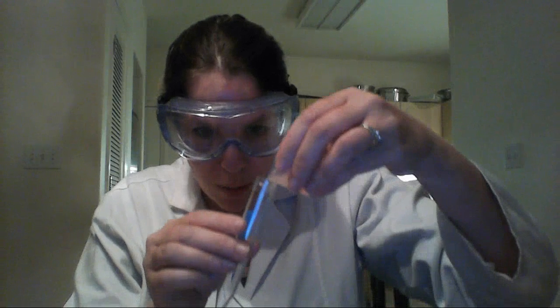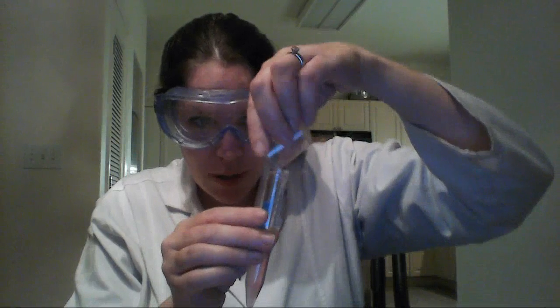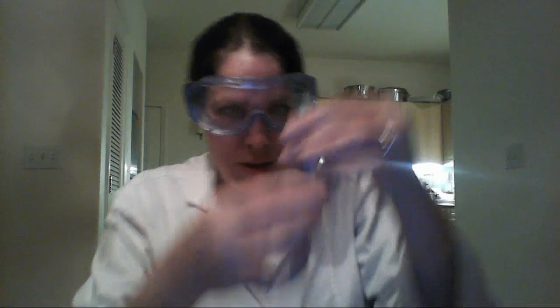Okay, so now my cheek cells have been mixing with that lysis buffer, just sitting there for about 2 minutes. Now I'm going to take my 15 milliliter tube and I'm just going to pour the contents in the medicine cup into the 15 milliliter tube. Just try not to spill it. Again, you guys should be wearing your gloves. Just try not to spill. Pour it in there. Okay. Yummy, yummy. Okay. So that gives me a total of about 7 milliliters of stuff in there. Okay, so that's in there now.